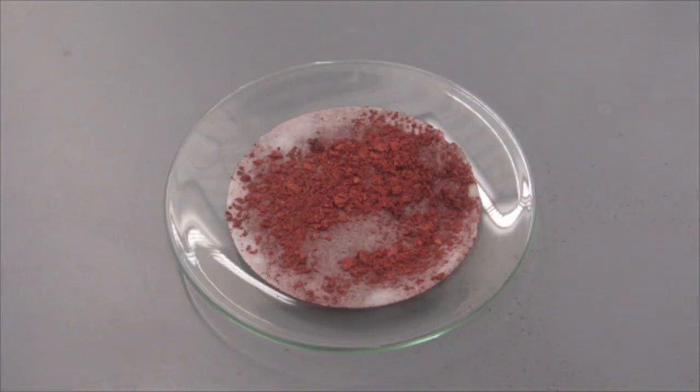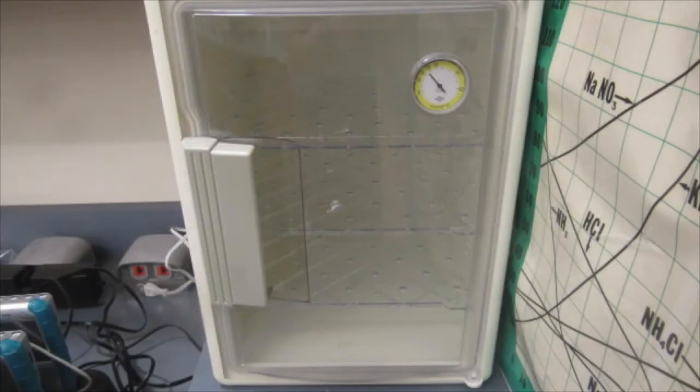In order to get all the water out of the copper so that when we weigh it, we get an accurate weight of copper, you can either place it in a desiccator, like we see here, and let it dry over a few days.